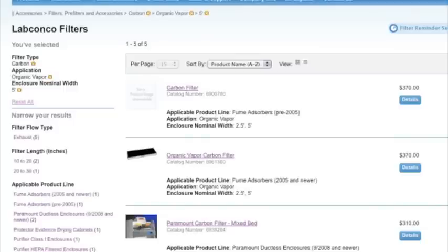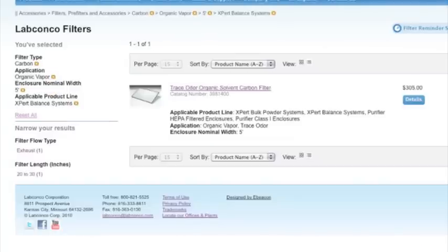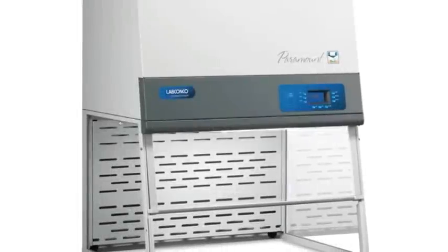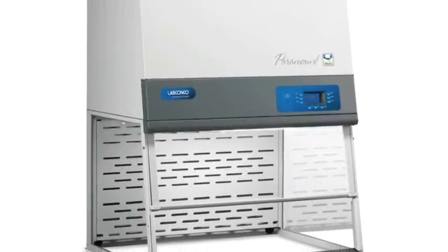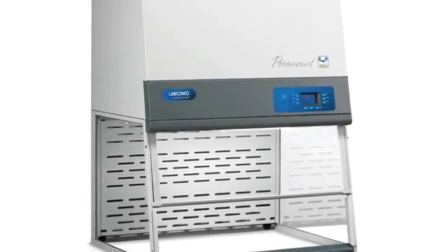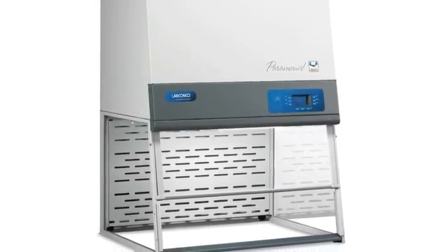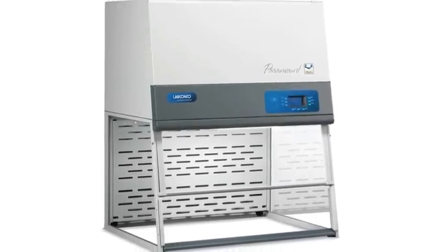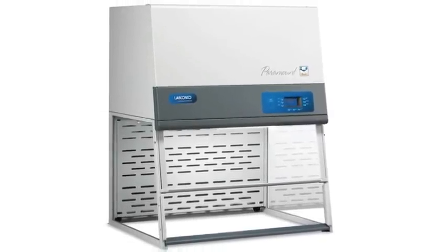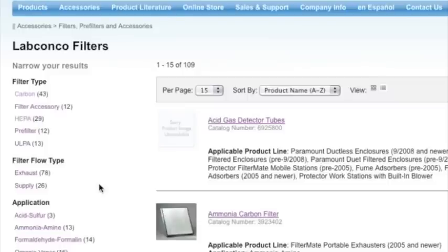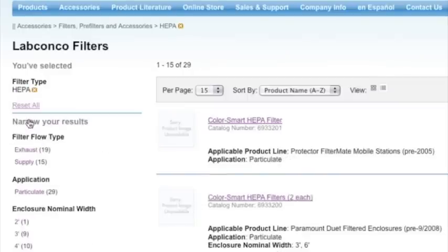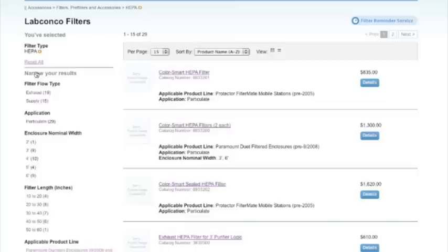For example, to find a HEPA filter for a Paramount ductless enclosure without knowing the exact catalog number, follow these steps. First, narrow the filters by filter type by clicking HEPA from the filter type group in the left column.